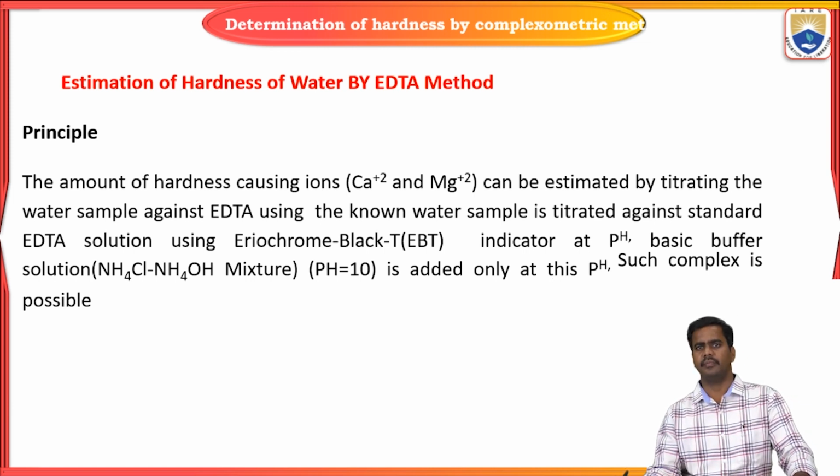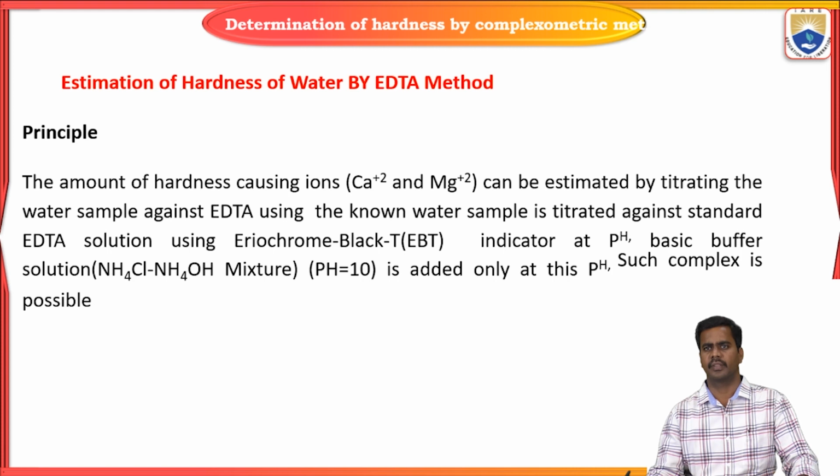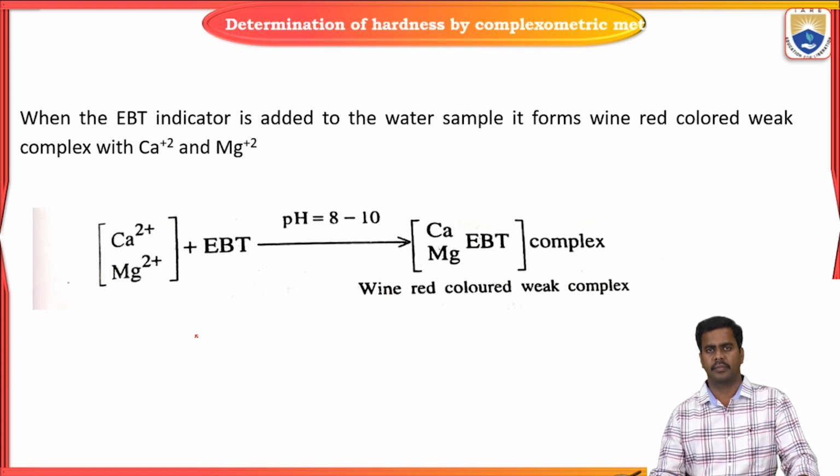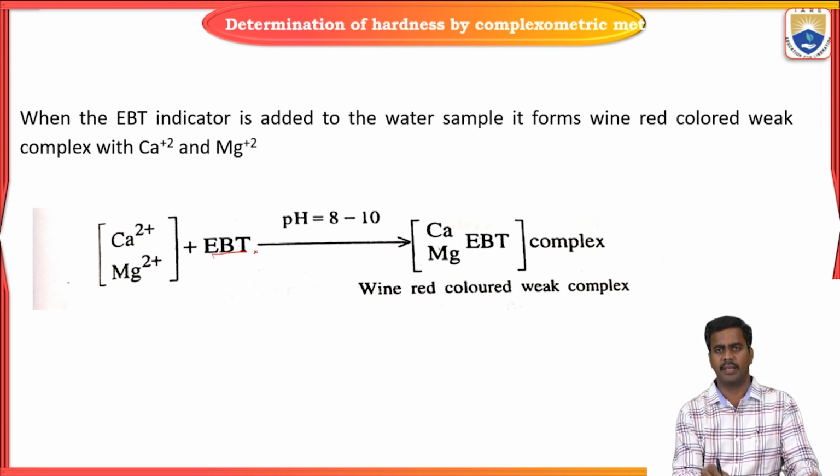Usually, some amount of hard water is taken into a beaker. To that add EBT. So what is the EBT here?